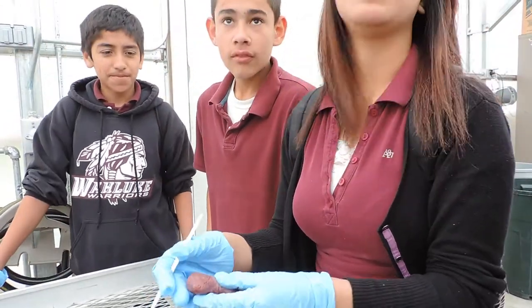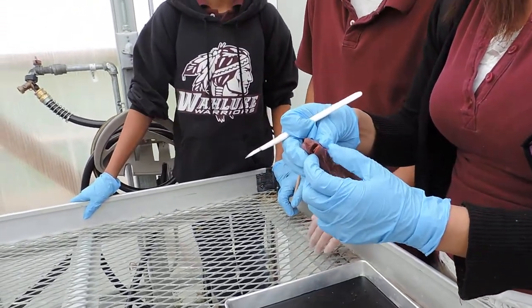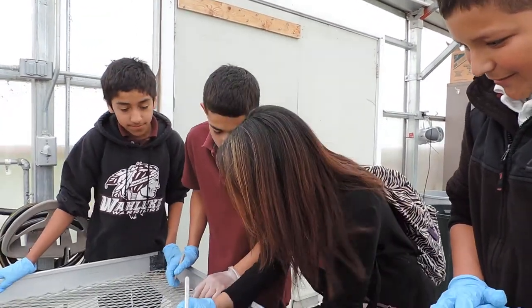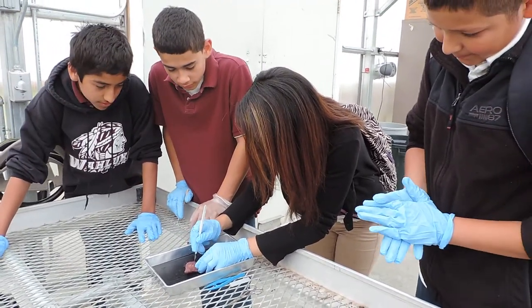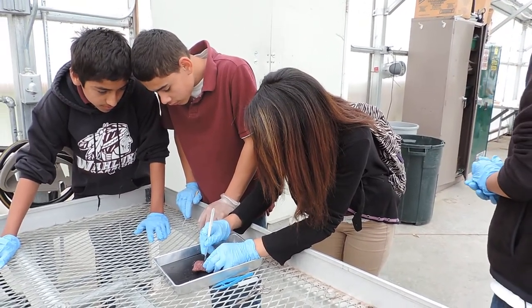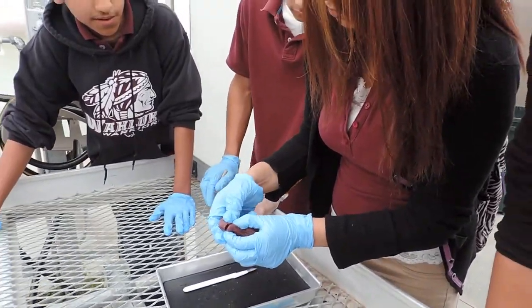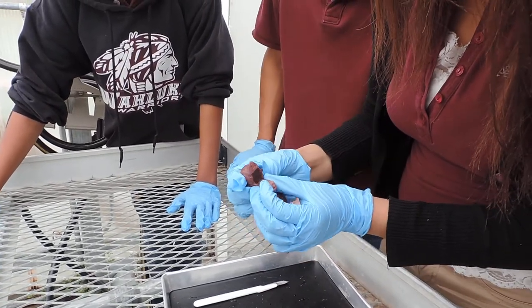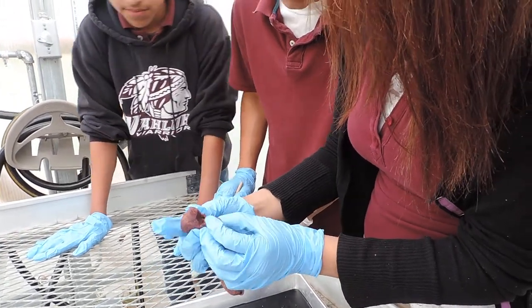What are you looking for again? The epiglottis. The ear cut down here. Off in the ear. You see it in there?